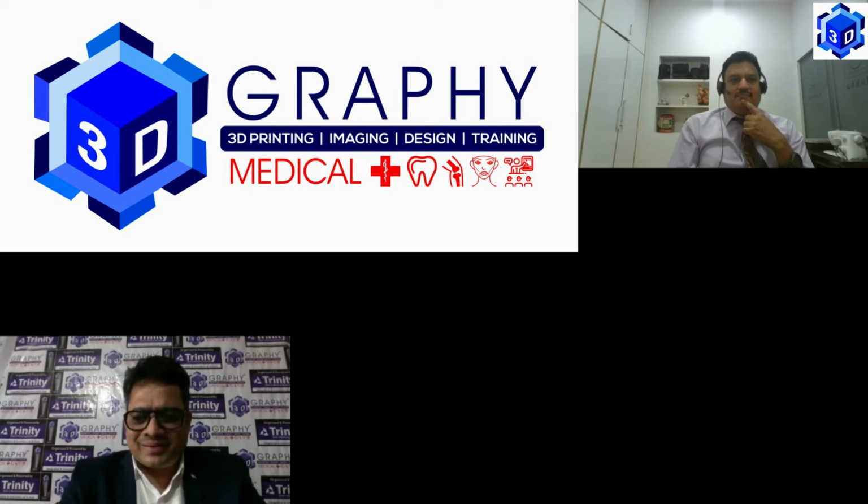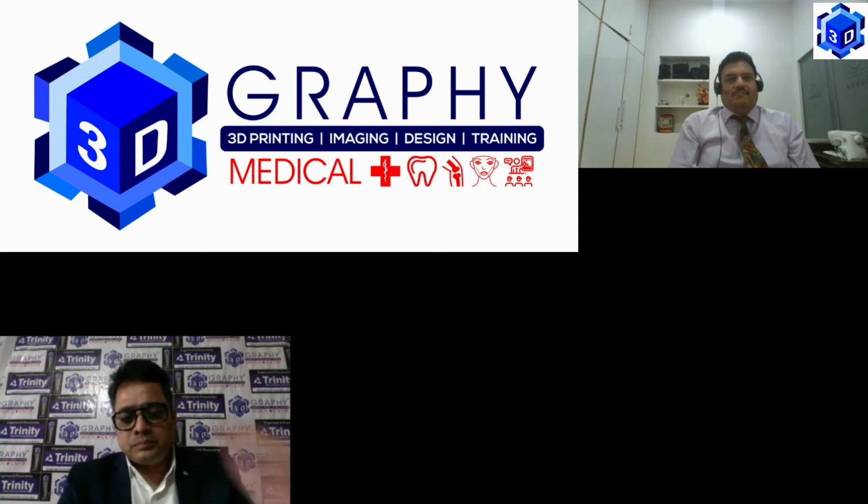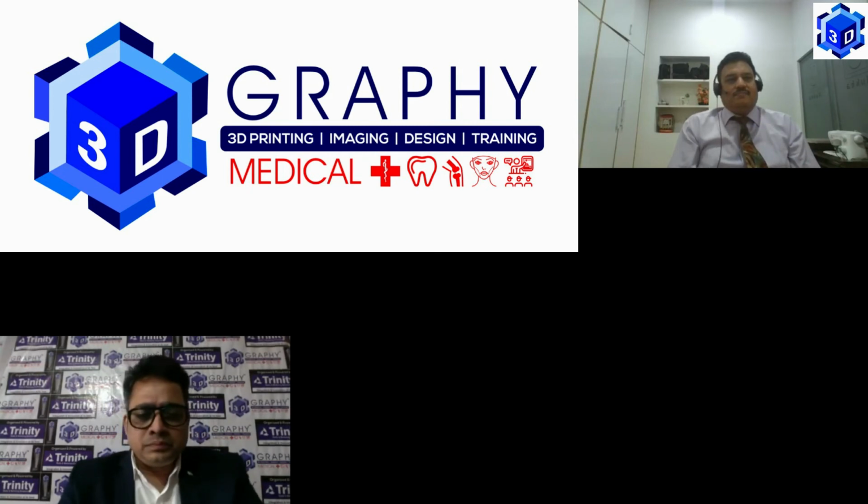Right, we at Nextpeak Innovation Labs work on 3D bioprinted skin. We are currently developing the epidermis, and the application is as an alternative to animal testing initially. But the goal is to see how we can develop a full thickness model, which will have both the dermoepidermal layers that can be used for treating certain types of wounds. So this is specifically what we were looking at.